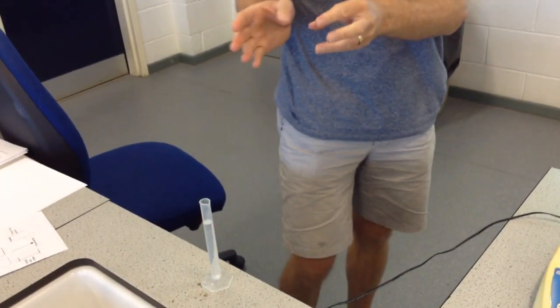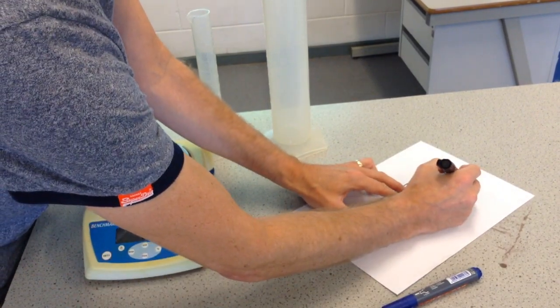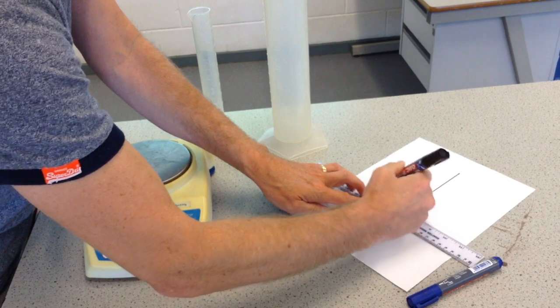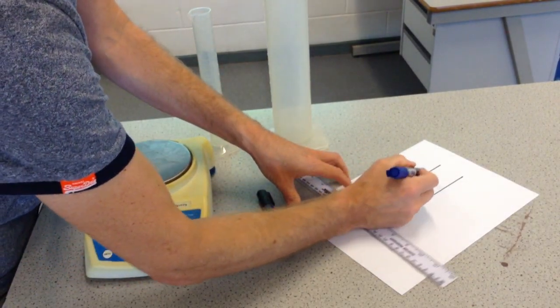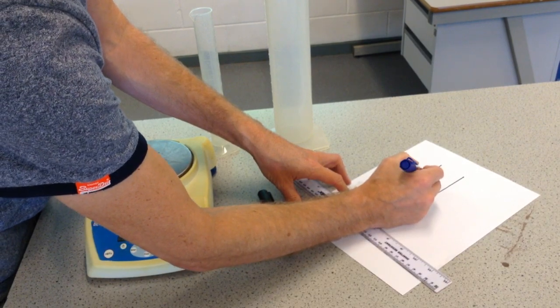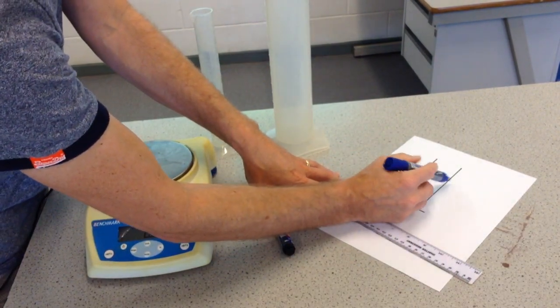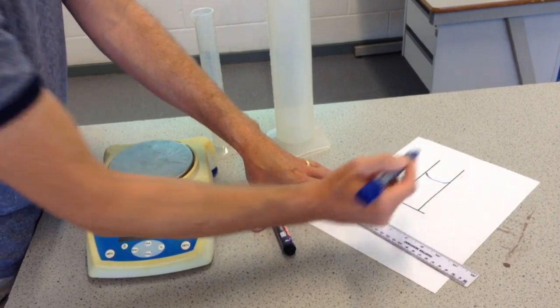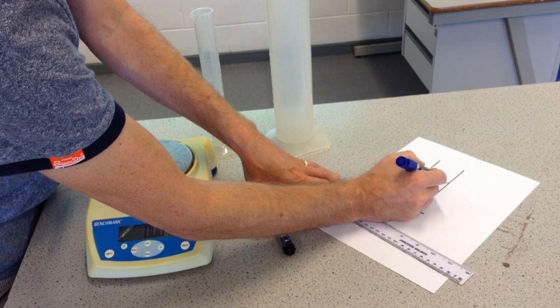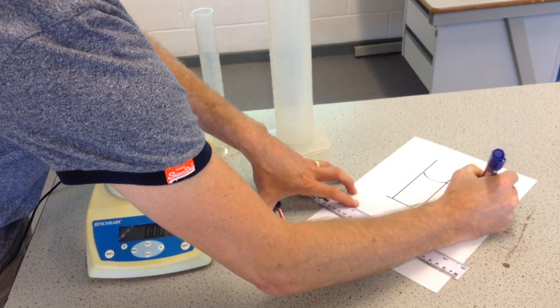There's something else about when you put liquid into measuring cylinders. When we draw measuring cylinders, we draw them like this. When you put water into a measuring cylinder, it doesn't stay flat — it sits in the cylinder like this, with a curve. The reason is because the water is attracted to the plastic, to the side, to the material. There's a little bit of static friction going on which attracts it, so it sticks up around the edges and there's a little dent or hollow in the centre. This curved line is known as a meniscus.